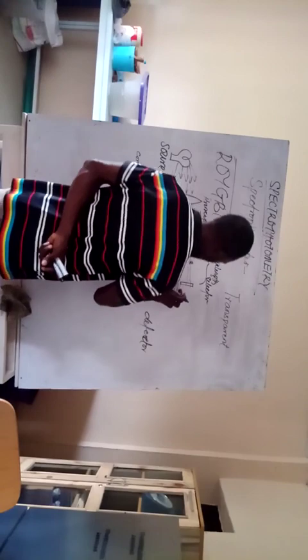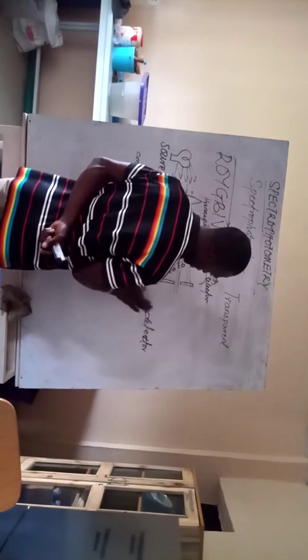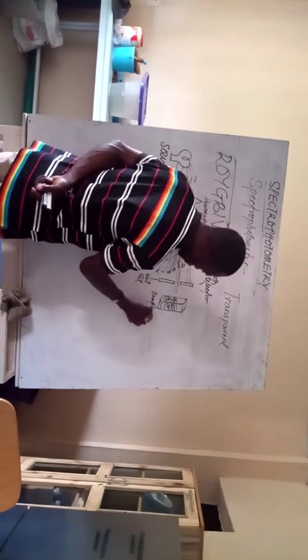The wavelength you have rotated it to is going to pass through this slit, and then you have what is called your sample. It is now going to get to your sample, which is kept in this container where you pour in your sample. This container is called the cuvette.